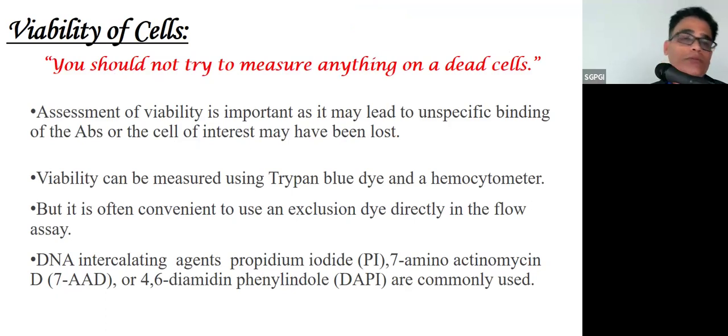Viability is also an important issue. When you are getting the sample, maybe an in-house sample or an outside sample. Basically, an in-house sample doesn't get affected in viability. It can be checked with 7-AAD. That is easy. Previously, DNA quantification was also done by PI, but nowadays we use the Fixable Cell Viability violet stain from Thermo Fisher.